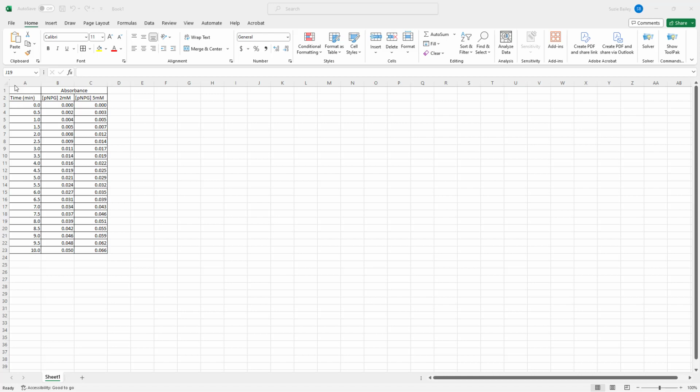course reaction, and I've arranged the data so that I have columns of like variables next to one another. So in the first column I have my time. Notice that the time is in increments of minutes or fractions of a minute.